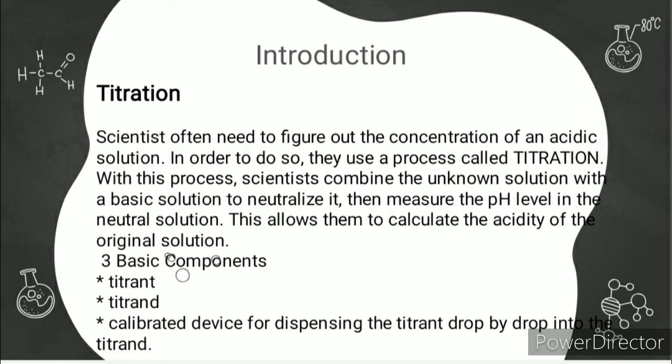So the last one is a calibrated device for dispensing the titrant drop by drop into the titrand. So later on you will see what this means, since it's just a tool used in this experiment which will later be explained to you as the video progresses.